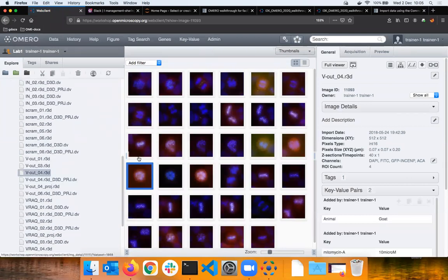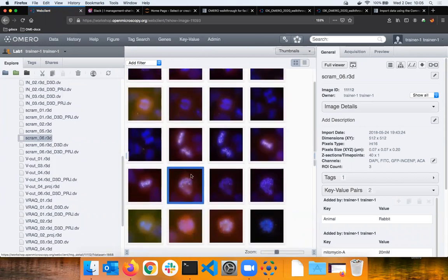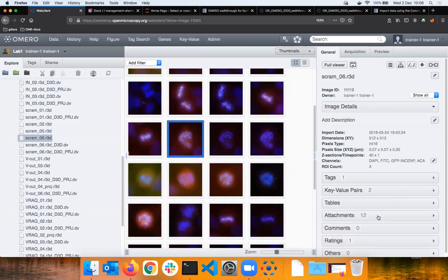Okay. Now let me come back to my favorite image here and double click on that image. I forgot something, pardon me. Let's not rush yet. Let's not show you something yet.